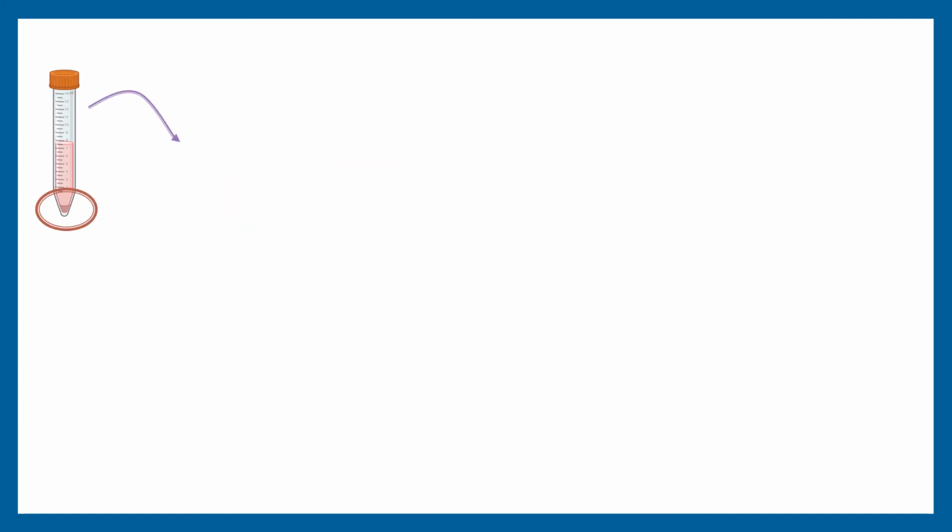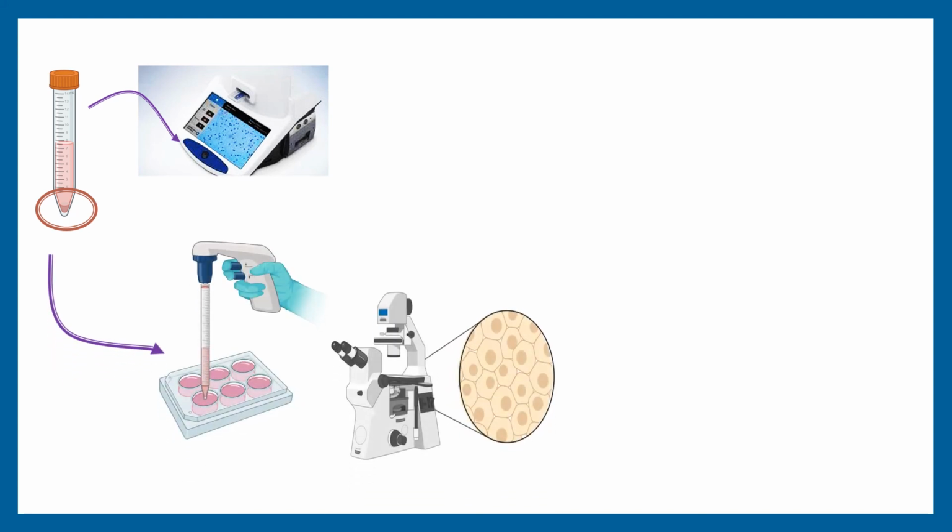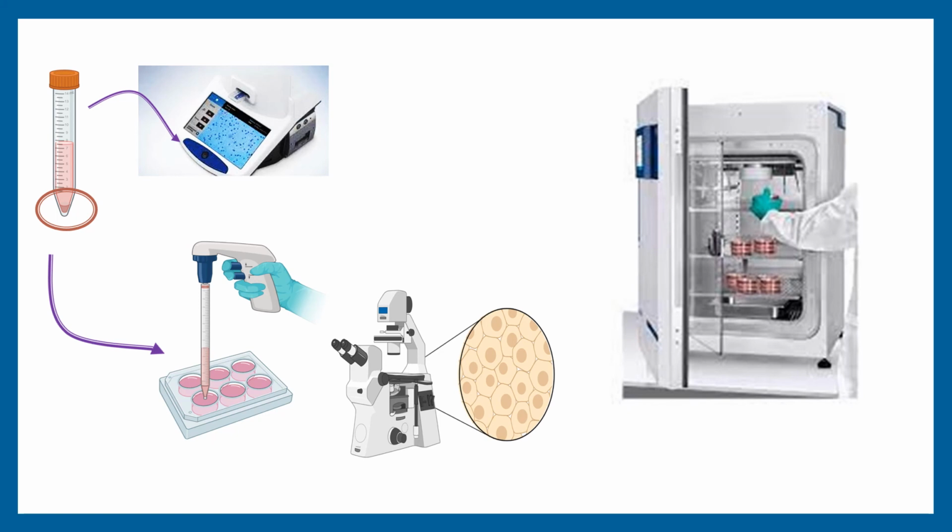Check the viability of the cells and then plate them on a flask or culture plates and then incubate the culture at 37 degrees Celsius in a suitable incubator or CO2 incubator. So these are the real images of 6-day cultured cells. Cuboidal and cobblestone morphology appeared. The right side image shows 100% confluency and is ready to subculture.